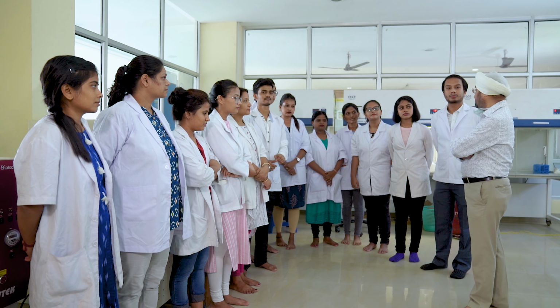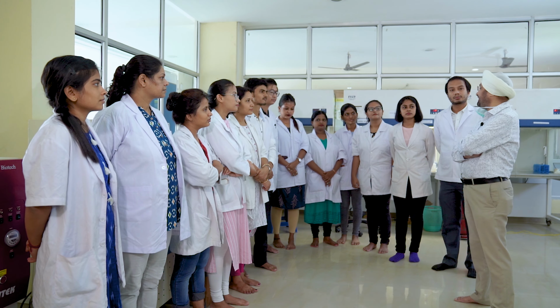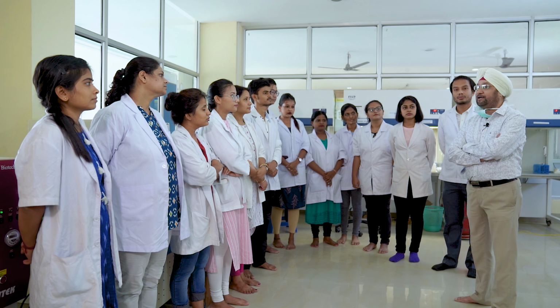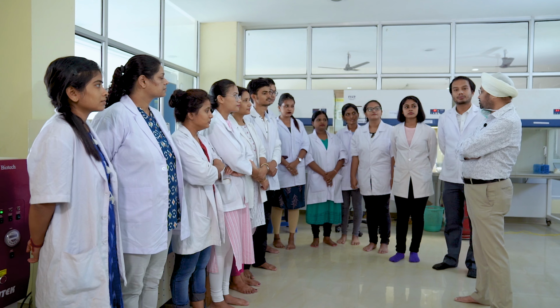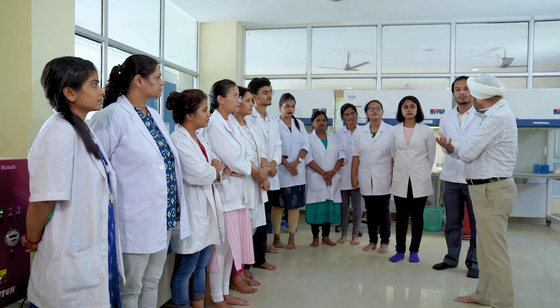As you all know, Agrobacterium is one of the most successful and proven methods by which we can transfer any foreign gene into crop plants. It is a soil-borne bacteria. It is also called a natural genetic engineer because in natural conditions, Agrobacterium can transfer its own DNA, which we call the T-DNA.